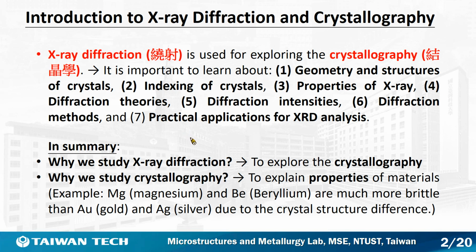Okay, and again, as we just know from the geometry and structures of crystals, and also how to index crystals, let's move on to talk about X-ray diffraction. We will first talk about the properties of X-ray, followed by diffraction theory, diffraction intensities, diffraction methods, and practical applications for XRD analysis.